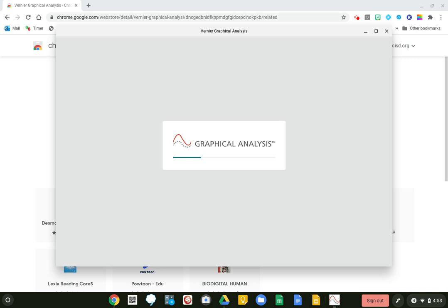That'll take a couple of minutes to come on up, but I just want you to see what it's going to look like. We will use this all year long for drawn graphs — it's a great little tool and it's not too complicated to use. I will go ahead and add another link to our Canvas site that shows you how to use this graph maker when it comes.